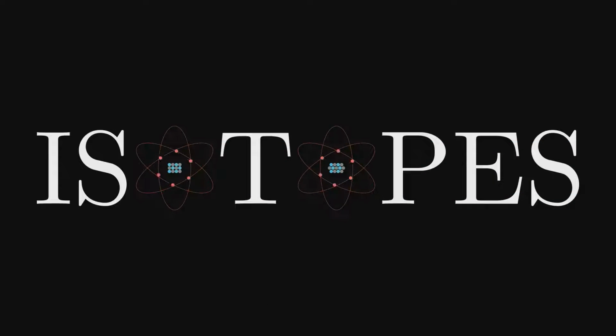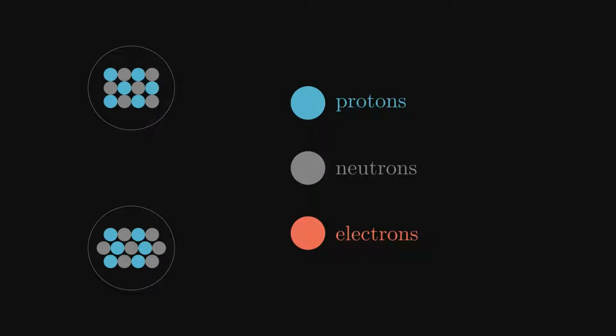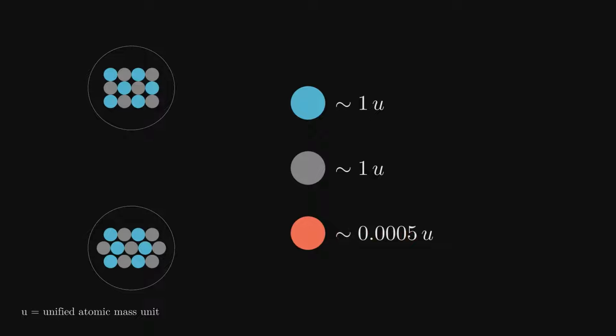Isotopes! Of course, they are atoms made of protons, neutrons, and electrons. However, we get to ignore electrons altogether for two reasons. First, they account for an insanely small portion of an atom's mass. Protons and neutrons have approximately equal masses of 1, while the electron is about 2,000 times lighter. If I scaled the electron accordingly, it would no longer be visible to us.